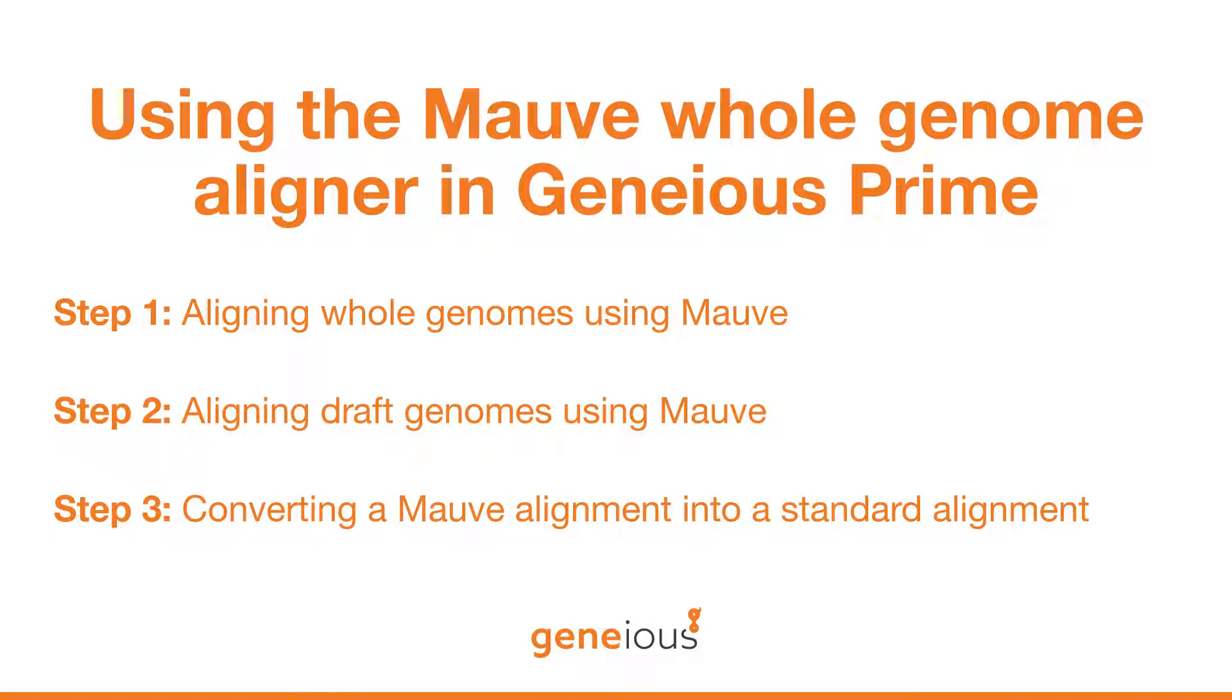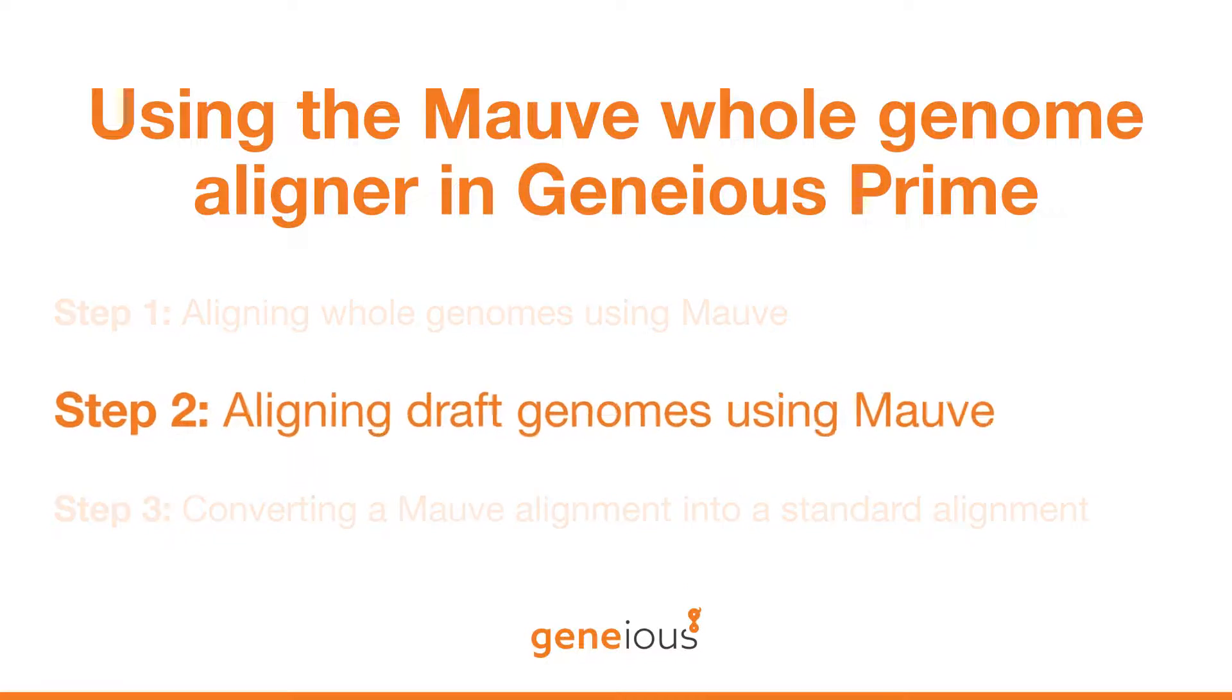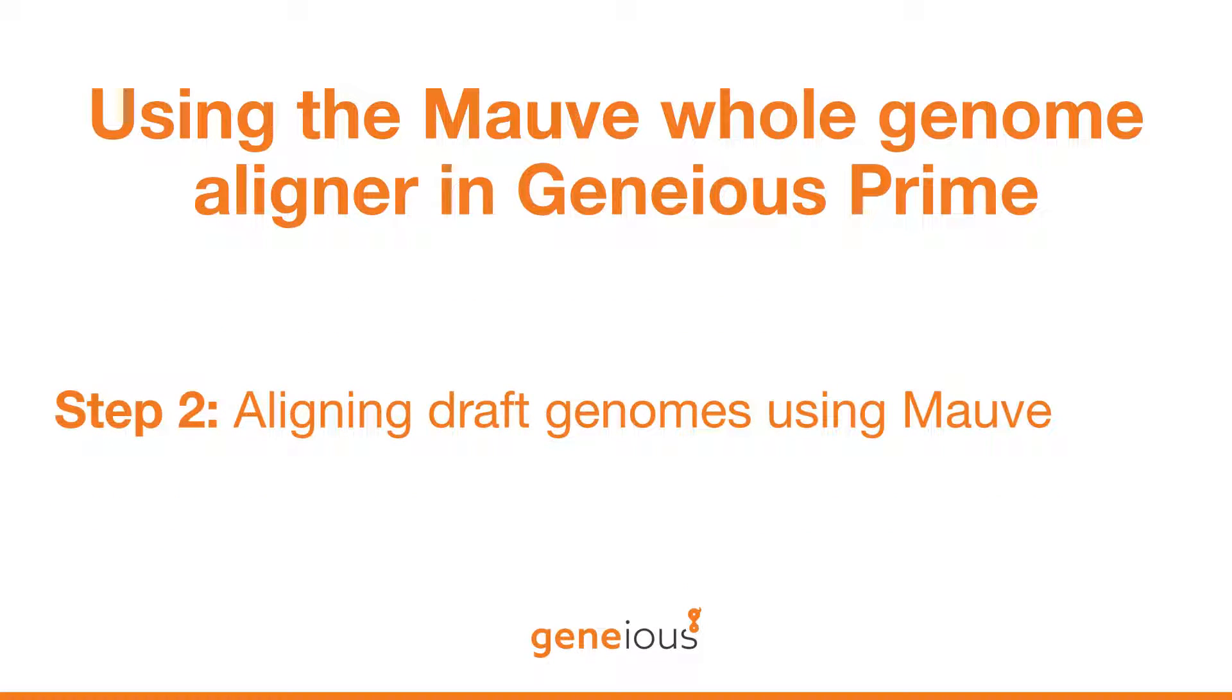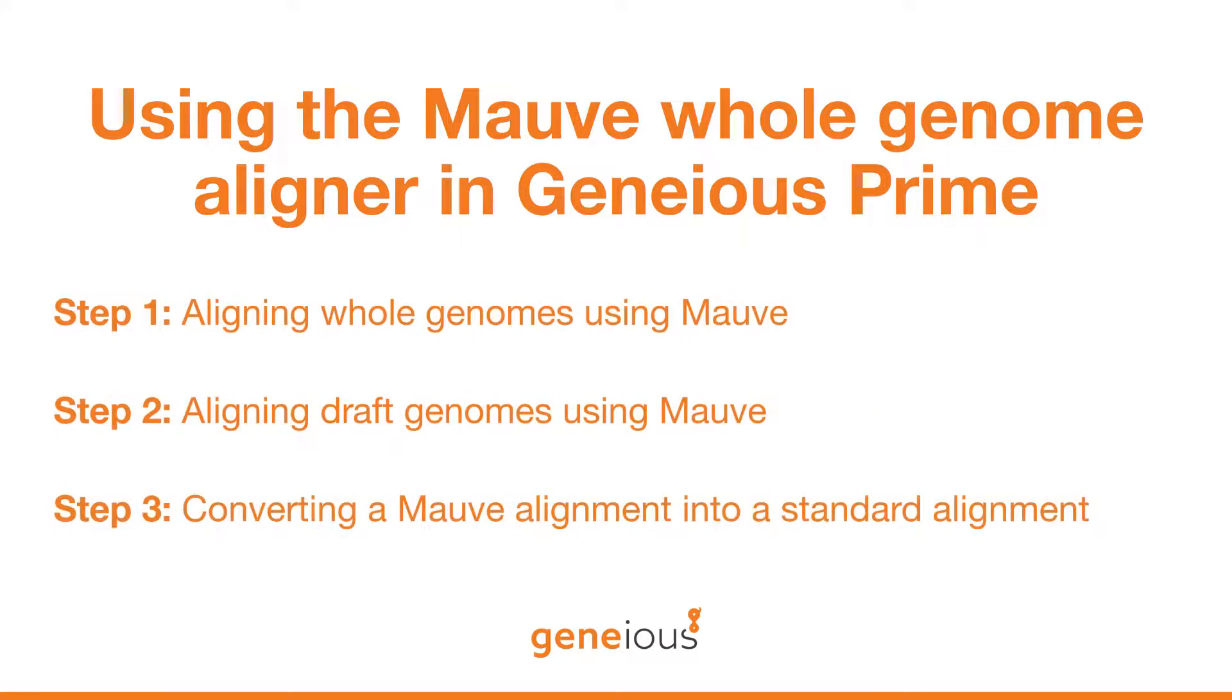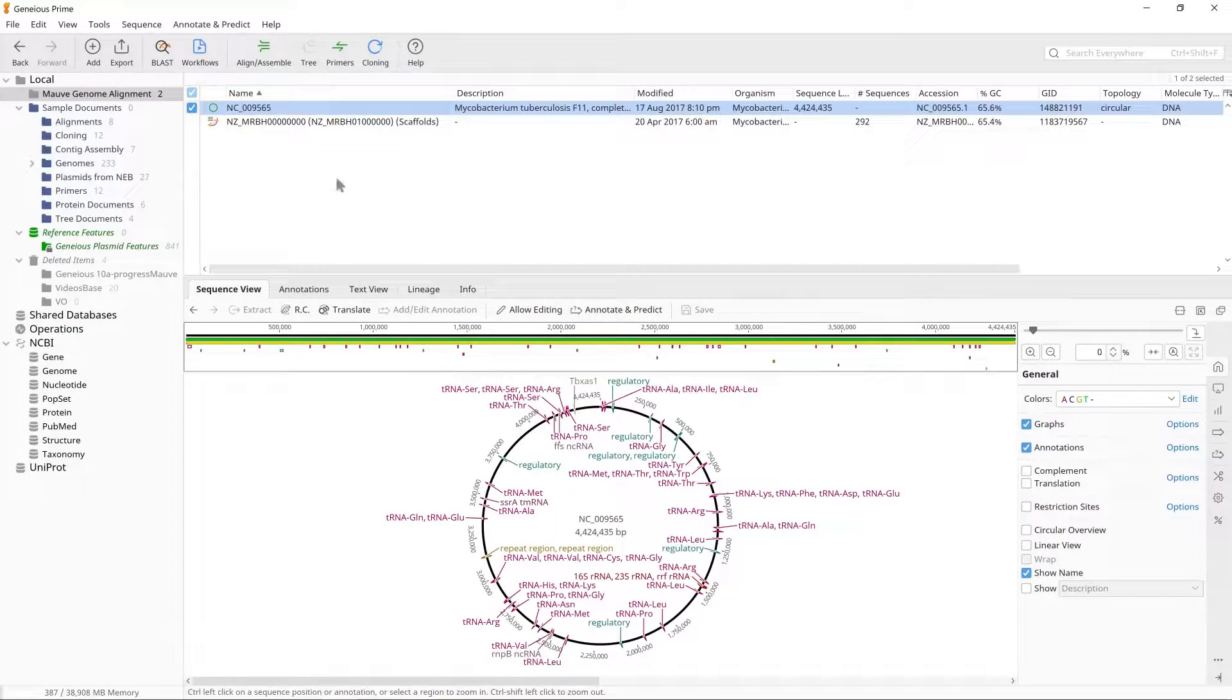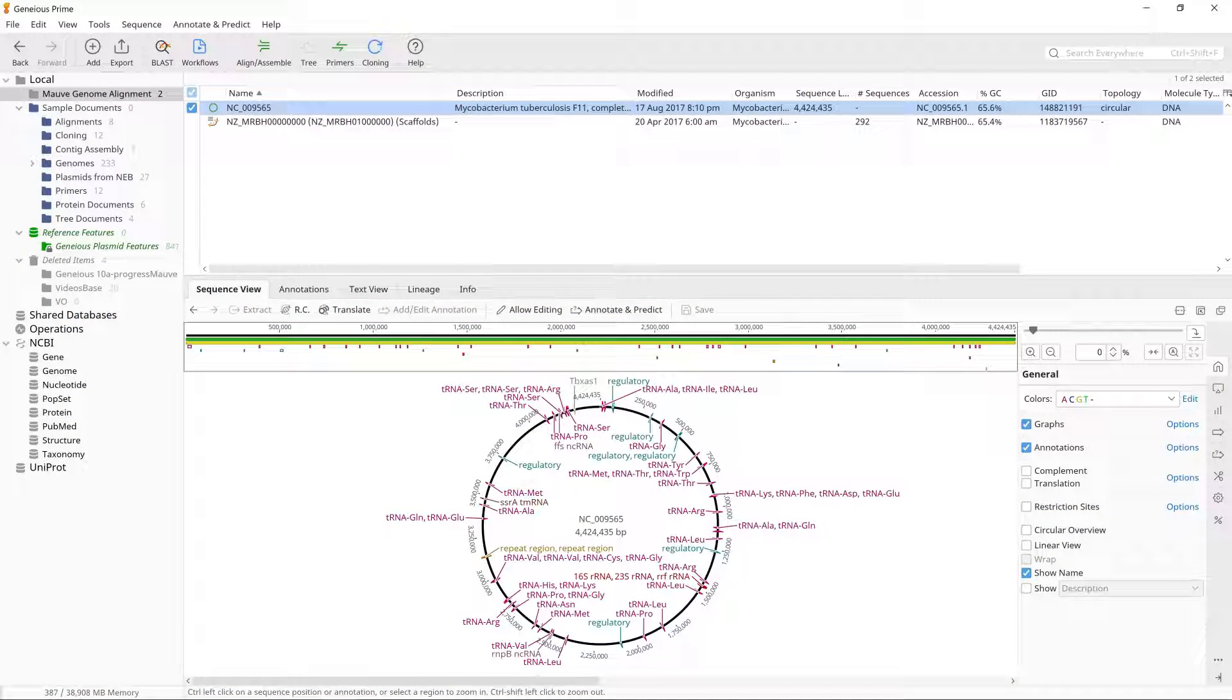This video series covers the use of the Mauve Whole Genome Aligner in Geneious Prime. In this second video you will learn to order a draft genome against a reference. This analysis uses the free Mauve plugin available from the plugins menu in Geneious.